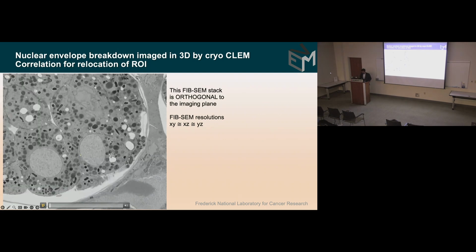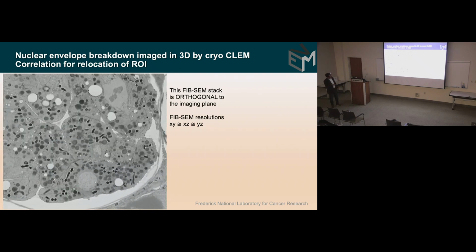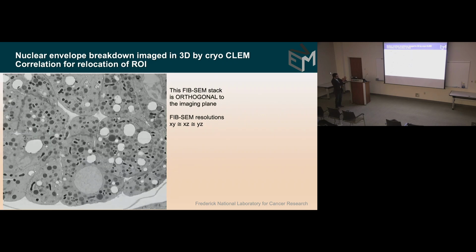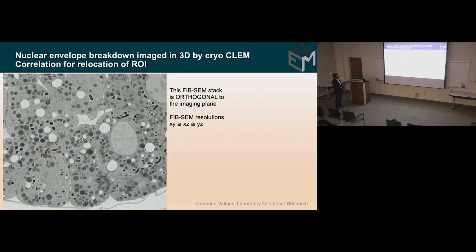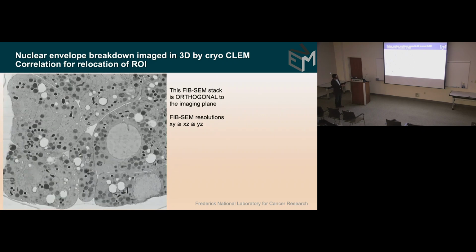And so now you can see, here's the multi-cell embryo stage. Here are the individual cells, and you want to get exactly the phase where the maternal and paternal DNA are sort of parallel to each other and facing each other. And give it a second.